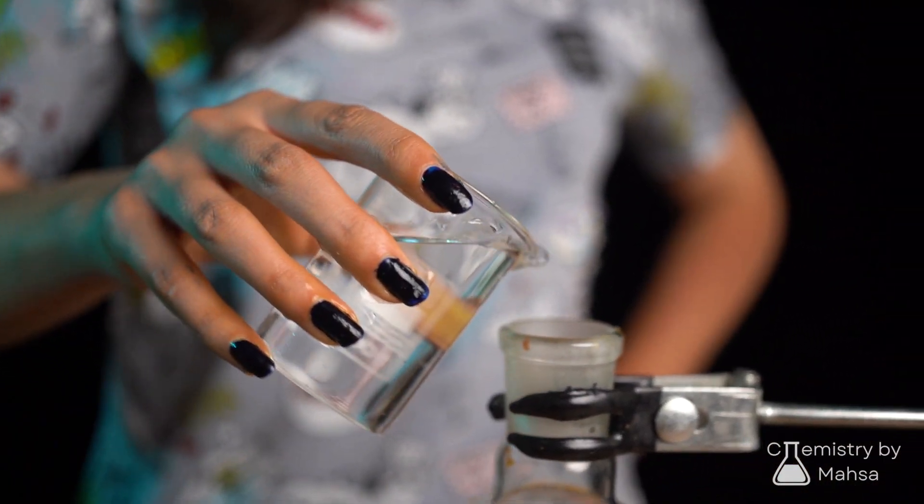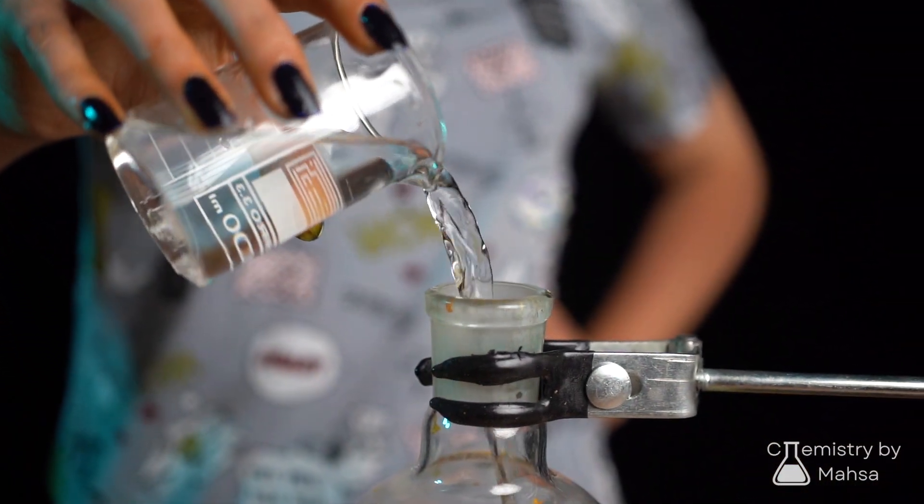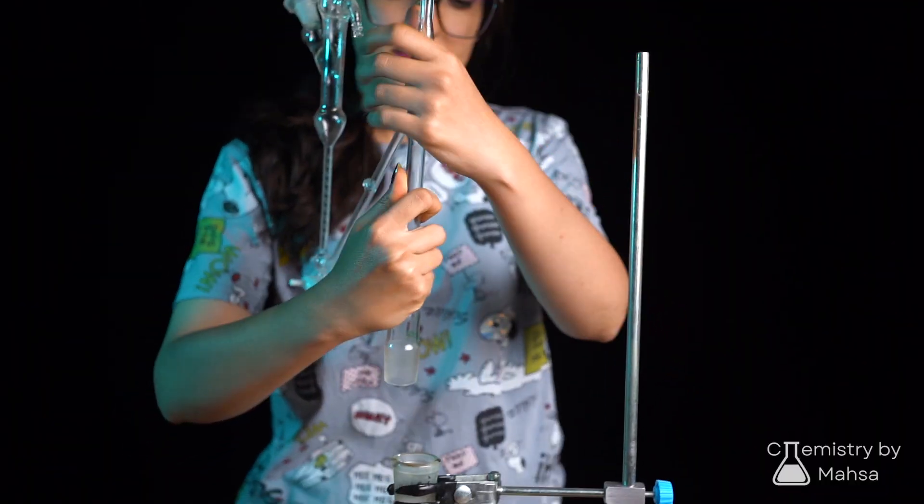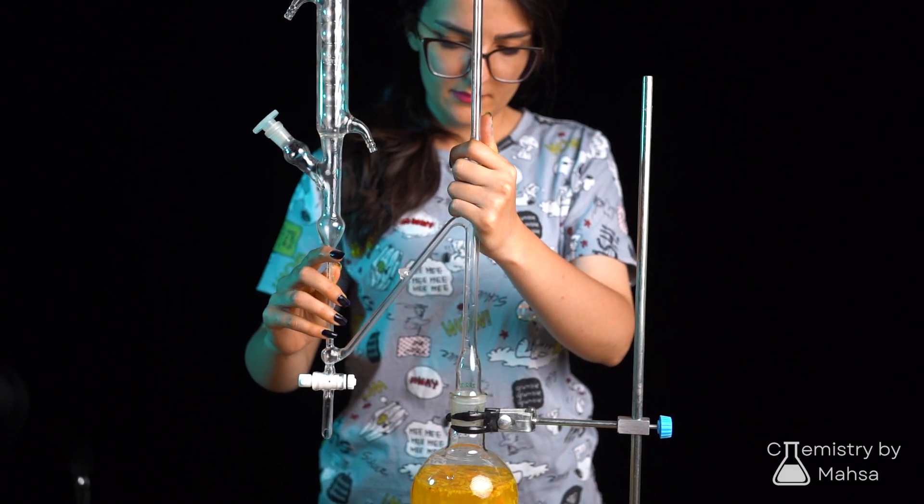Transfer the orange peels to a round bottom flask and add water to it afterwards. The ratio between the amount of orange peels and water should be 1 to 5.